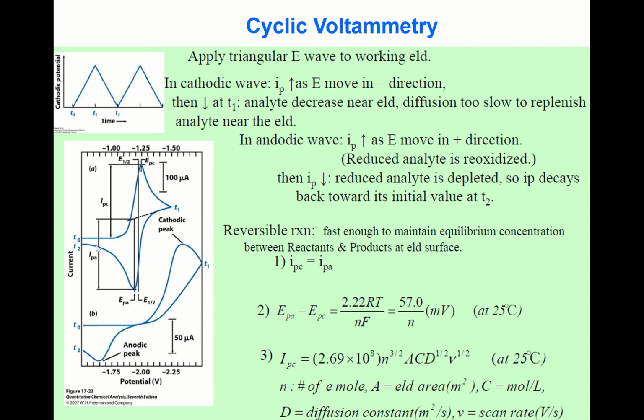And when you scan positively, let's look at this voltammogram. In here, you scan from maybe minus 1.5 volt down to minus maybe 2.5 volt. Okay, here you scan, starting from here, and this is a typical voltammogram. And then at this potential, the current, the y-axis is current, begins to increase. Since you scan negatively, this increased current is reduction current.